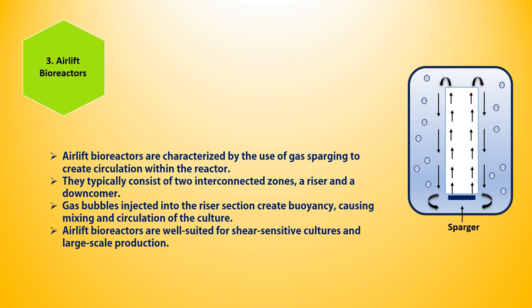So with this mycelial mat, if we use impellers for the agitation, then there will be every chance of entangling the fungal hypha with the impellers, and shearing of the fungal hyphae takes place. That will limit the growth, and we will never find the optimum growth of the fungi within the bioreactor. So in those cases where shearing of the fungal hyphae or of the microbes is a concern, we generally use air-lift bioreactors or bubble column bioreactors.